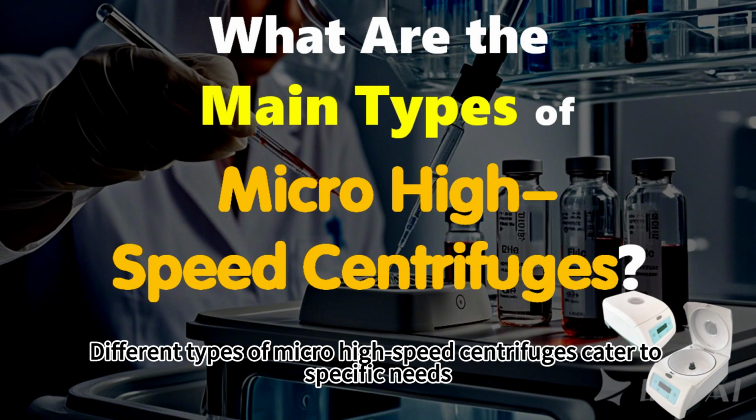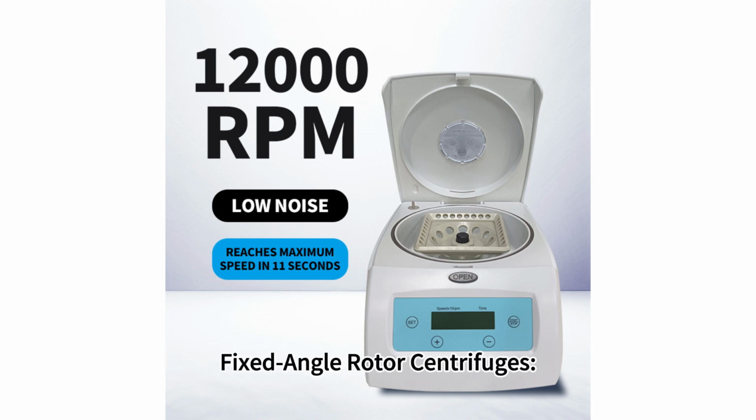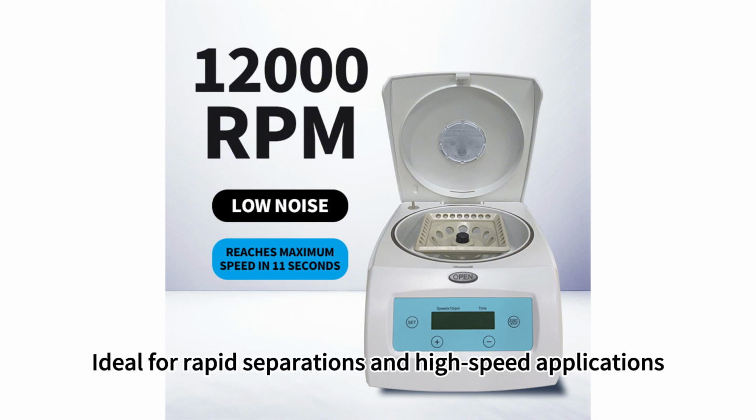Different types of micro-high-speed centrifuges cater to specific needs, making it important to understand their variations to select the most suitable model. Main types: fixed-angle rotor centrifuges. Description: hold tubes at a set angle relative to the axis of rotation. Uses: ideal for rapid separations and high-speed applications.